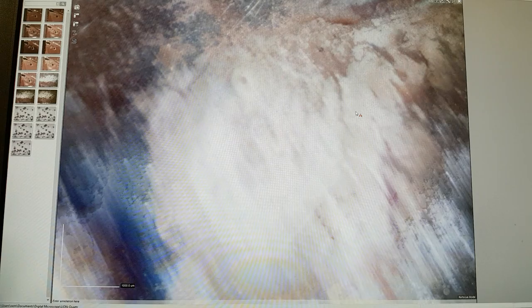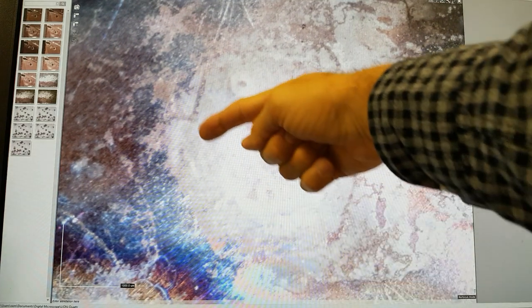Here it is on the microscope — you can see the white one here, and if I move it you can see its evil twin over here. When I look at this and rotate it around, there's a bit of perspective distortion because I'm having to look up at the camera, but essentially you might see what I see — which is a hexagon.